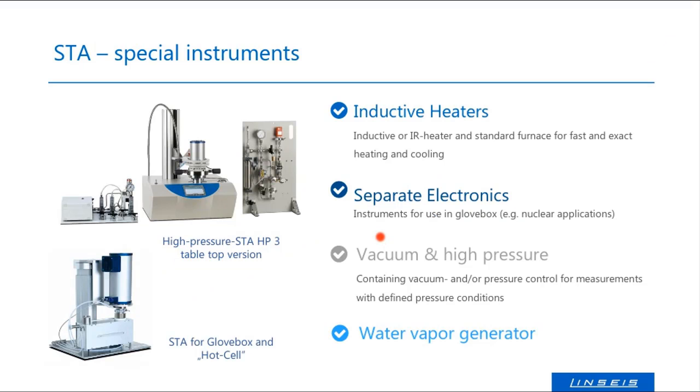CP determination is not so easy. There are several guidelines available, and I can explain that in detail because our next webinar series will be some special applications. One of them will be how to measure CP with the DSC. Anybody who's interested can have a short guideline how to do that.